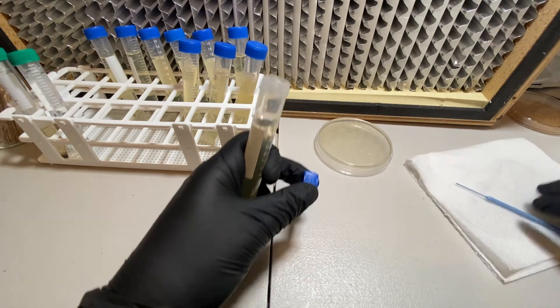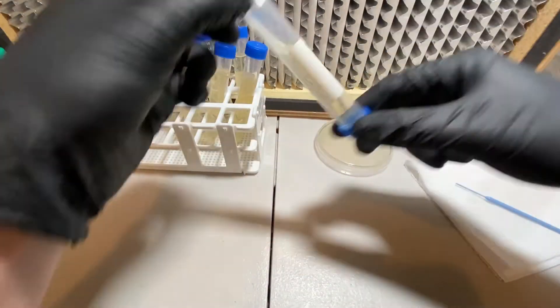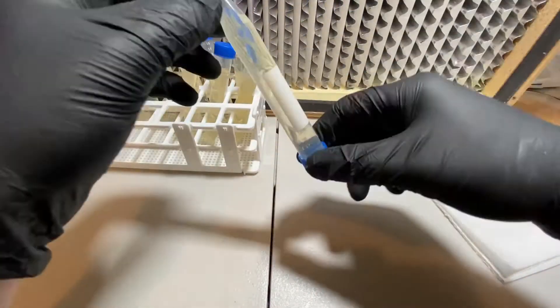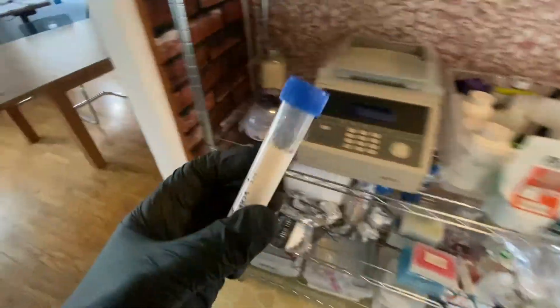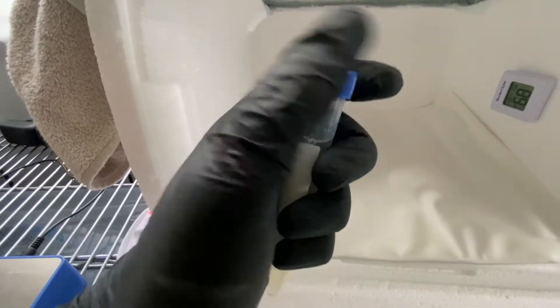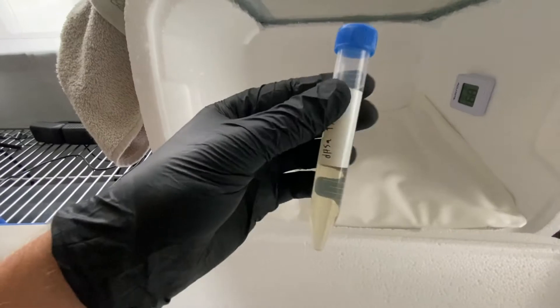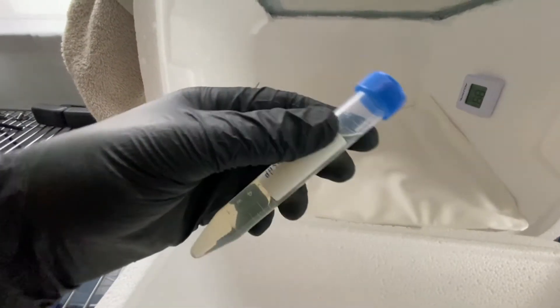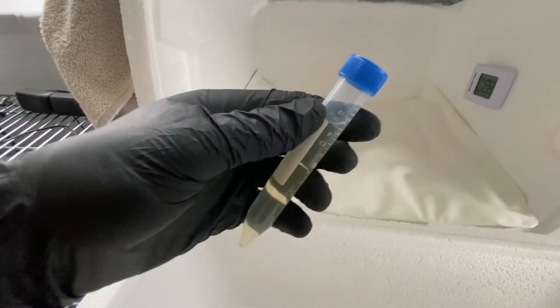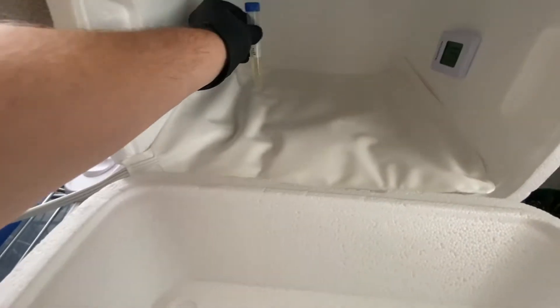Now I'm going to shake, shake, shake to get some of those cells in here. That should be good. Close this up, give it a little shake. Now I'm going to take this and put it into the incubator, but I am going to lightly loosen the cap so the E. coli as it grows can get a little bit of air. If you don't do that, it actually creates a suction because it uses up the air, and when you open it you can hear it go. So I just loosen it up a little bit, not too much so it would risk falling, and then lean it up against the edge.